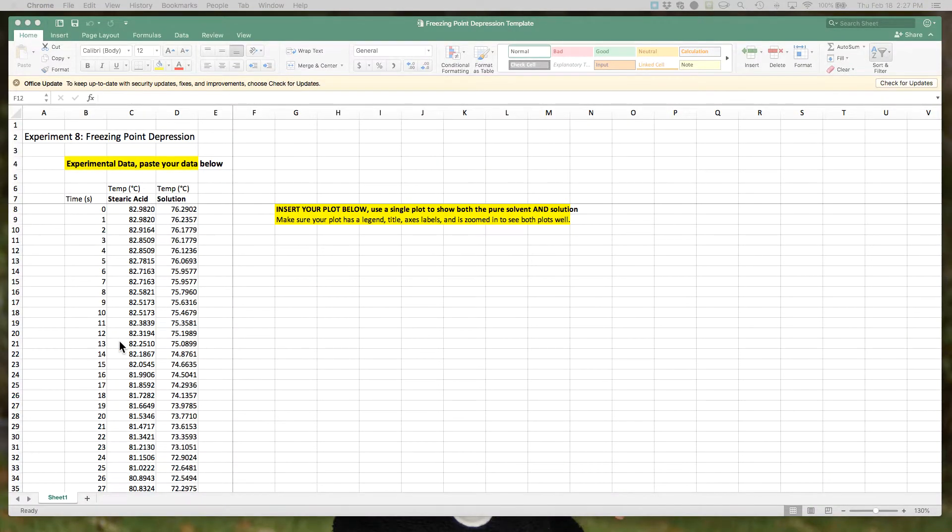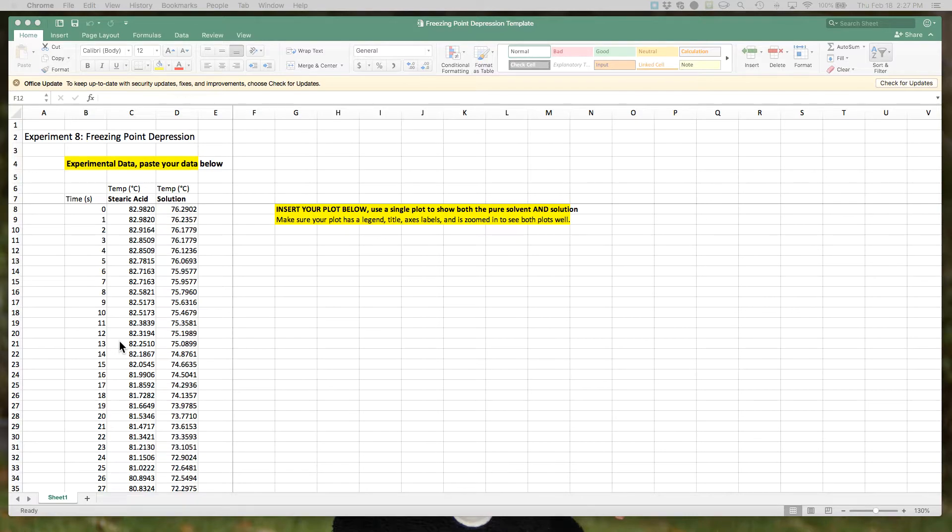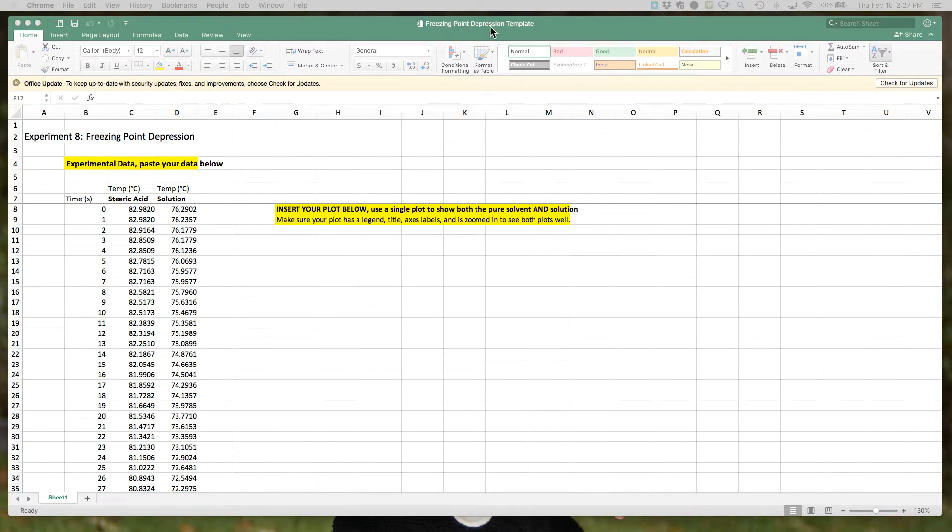This video is designed to help you with the data analysis in the Excel spreadsheet for Experiment 8, the freezing point depression lab. What you should be able to see on my screen is the freezing point depression template spreadsheet.